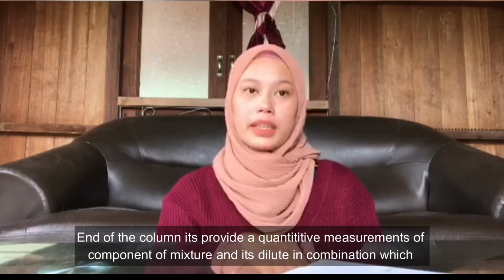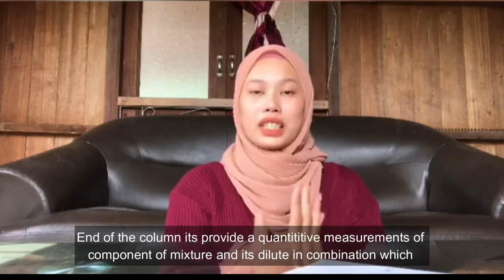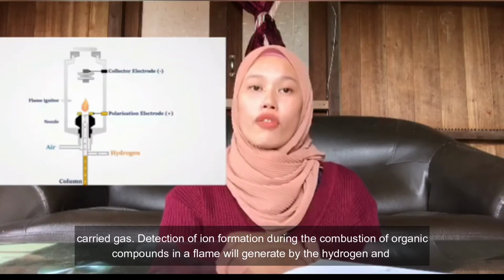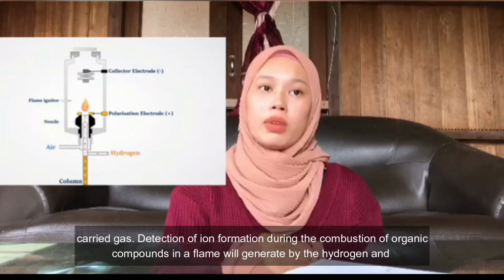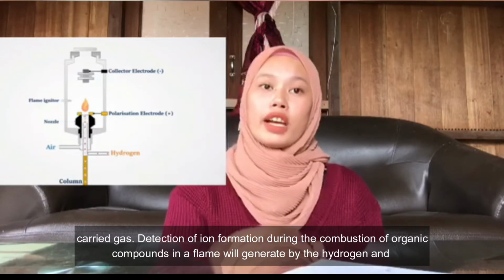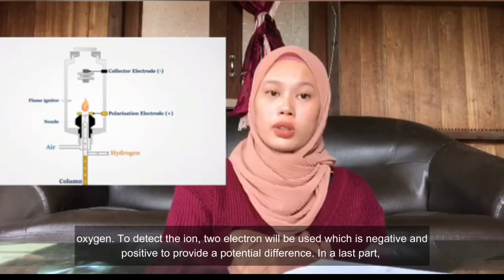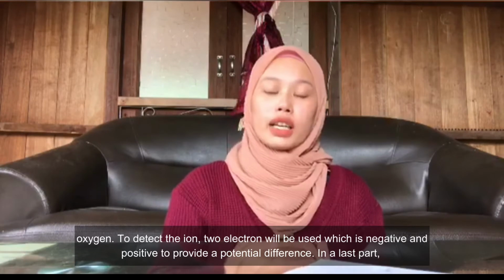The end of the column provides a quantitative measurement of the components of the mixture as they elute in combination with the carrier gas. Detection of ion formation during the combustion of organic compounds in a flame is generated by hydrogen and oxygen. To detect the ions, two electrodes are used, one negative and one positive, to provide a potential difference.